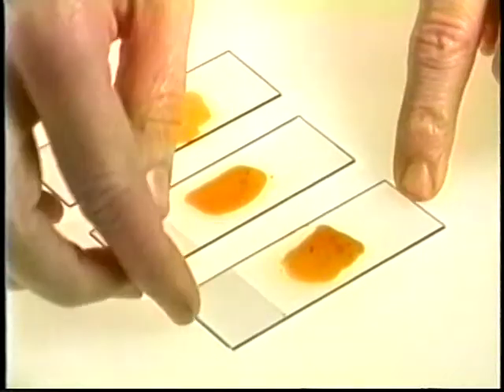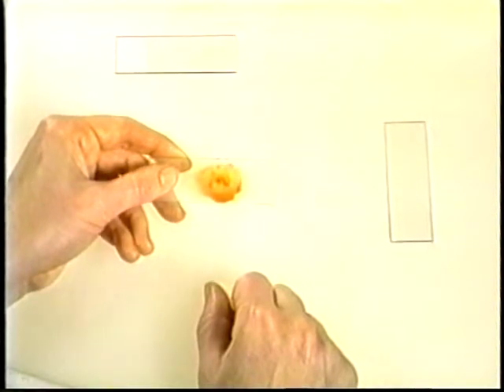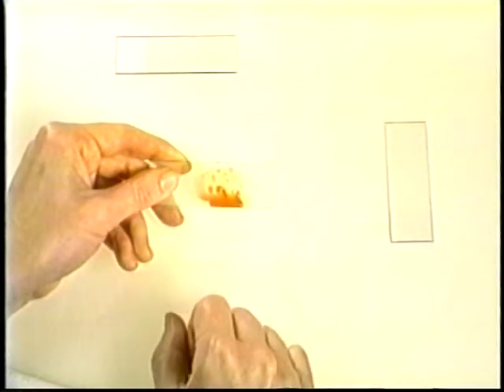There are several ways to concentrate tissue fragments, and now I will show you how. If there are several slides, make a quick assessment and start working with a slide that shows multiple fragments. If no fragments are visible to the unaided eye, the harvest is probably non-diagnostic, and the repeat thin needle aspiration biopsy may yield better material. Now tilt the slide sideways. This will make the fluid collect along the bottom edge and leave the fragments exposed over the rest of the slide.